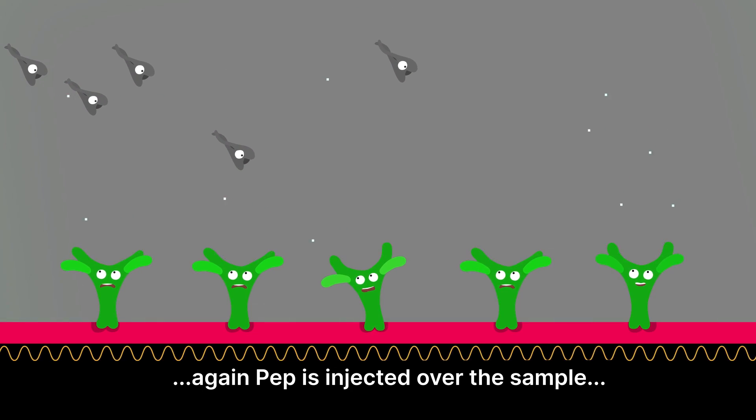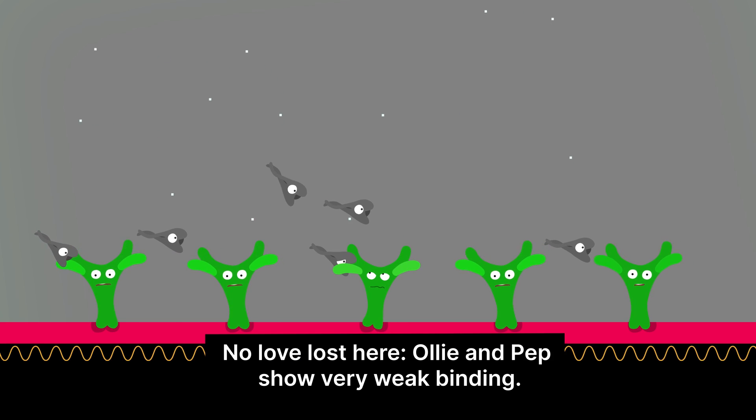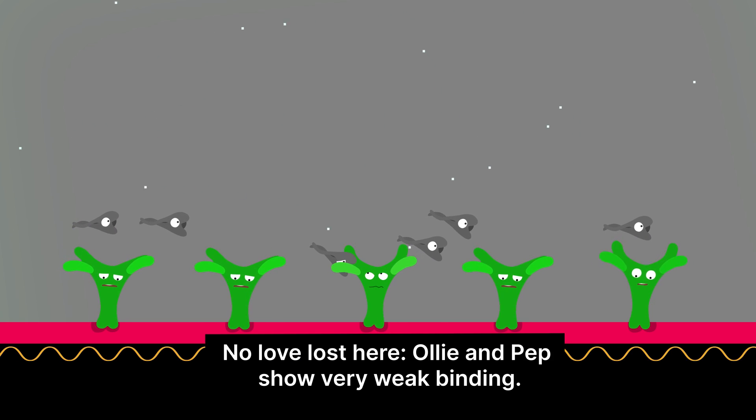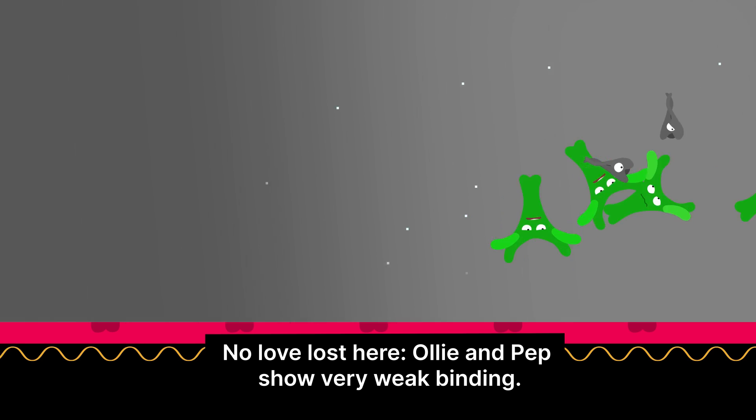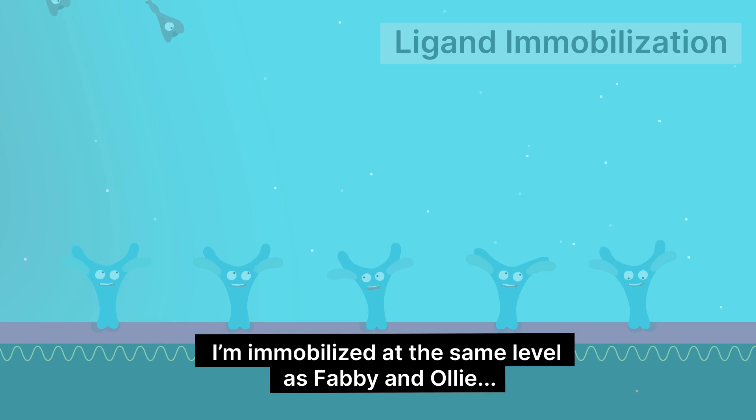It makes life so easy. Again, Pep is injected over the sample and binding affinity is measured. No love lost here — Ollie and Pep show very weak binding. Finally, it's my turn. I'm immobilized at the same level as Fabi and Ollie.